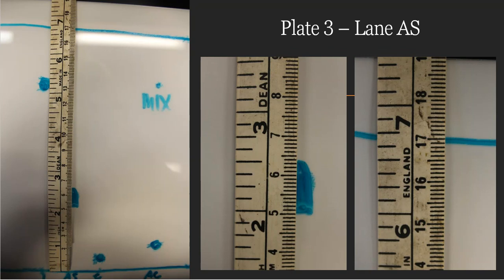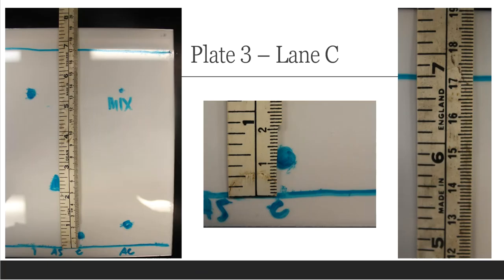Here's plate 3, which is lane AS. That's acetyl salicylic acid. To the left, you'll see the whole lane at once. So I zoomed in on this area to give you the spot that's here. And then I zoomed in on this area to give you the mobile phase line that's there. So you know what to do with those numbers.